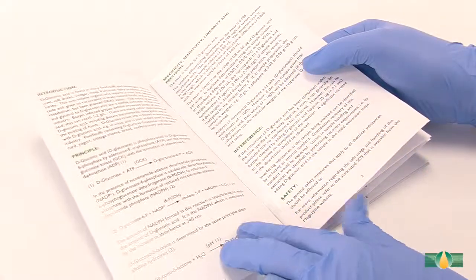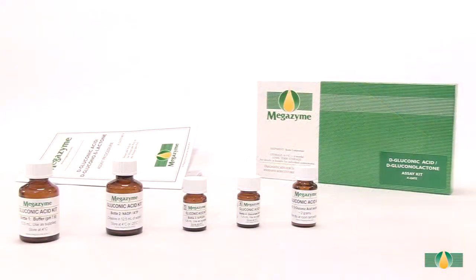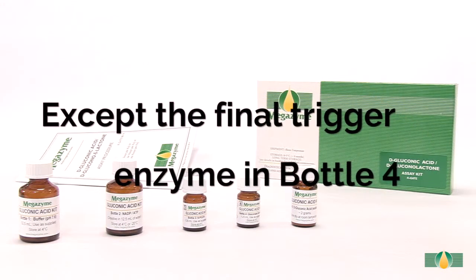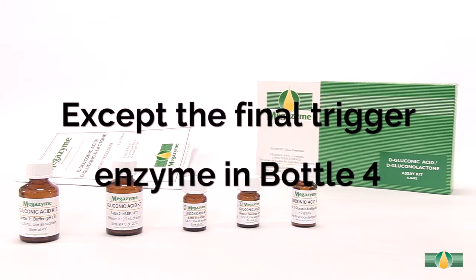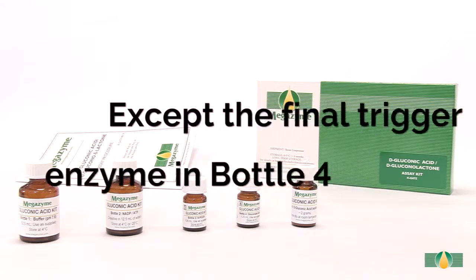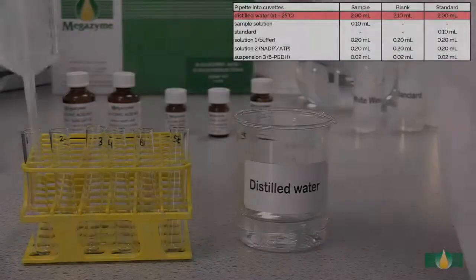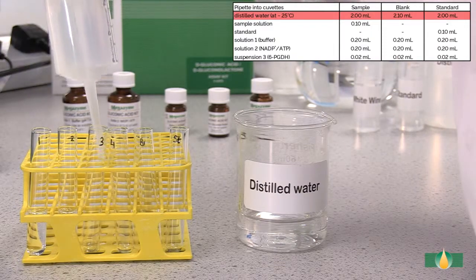Follow the manual assay procedure as described in the data booklet. Pipette all assay components except the final trigger enzyme in bottle 4 into each assay tube. A blank reaction and a standard reaction must be performed with each batch of samples. Pipette 2.0 millilitres of distilled water into all assay tubes.